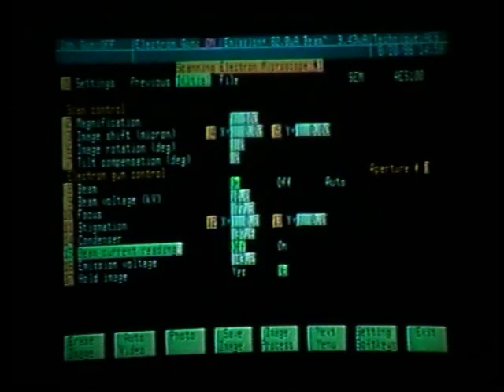Once again, since we have more current, I want to press soft key number 2, which will activate the auto video and reset our secondary electron multiplier. Going to the TV screen, we are at 100x magnification. What we need to do now is bring that into focus.